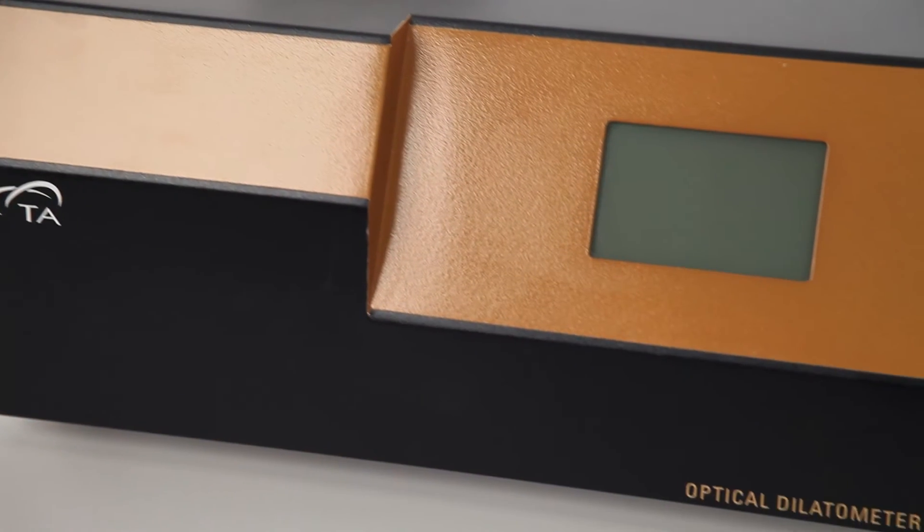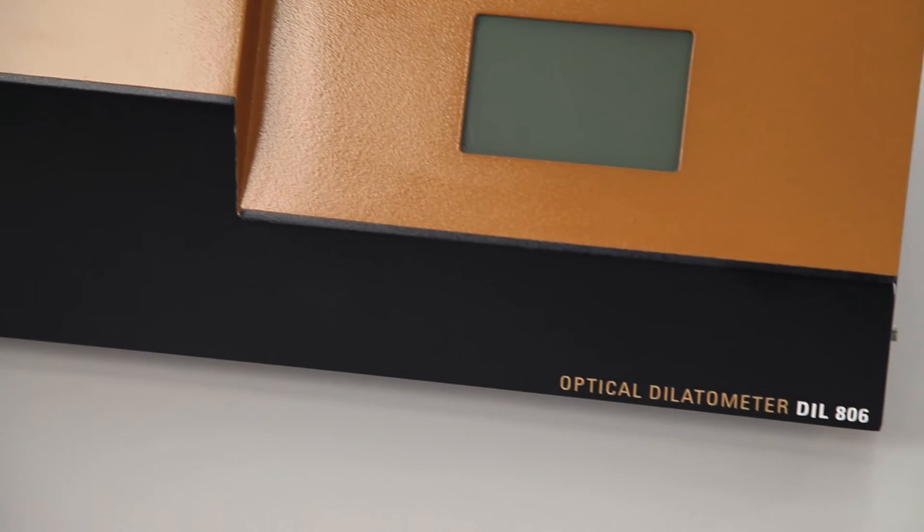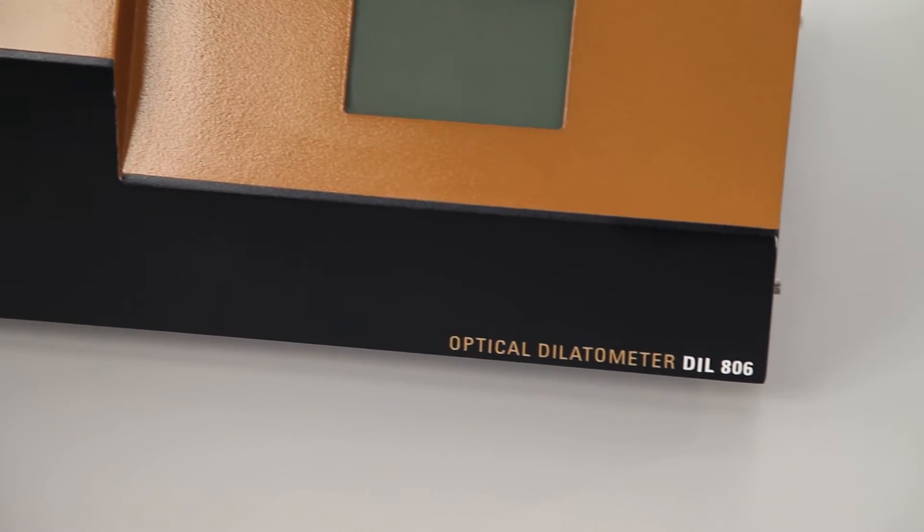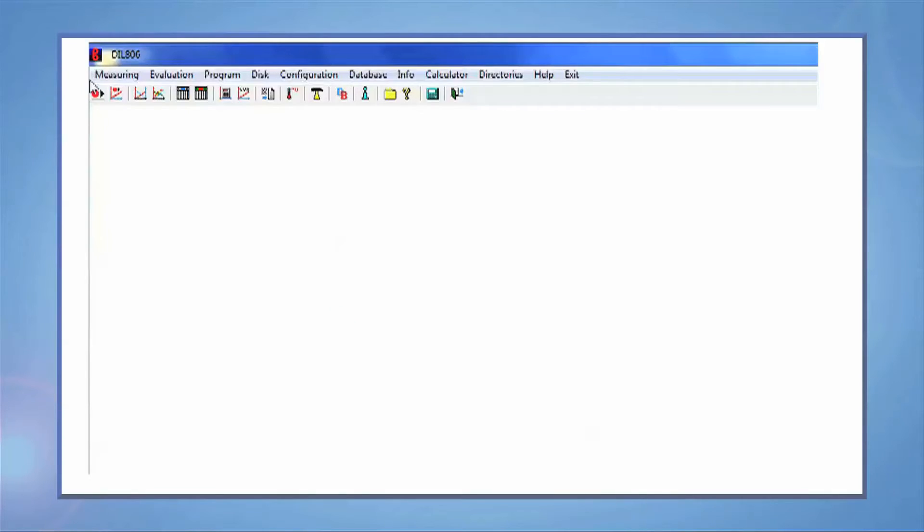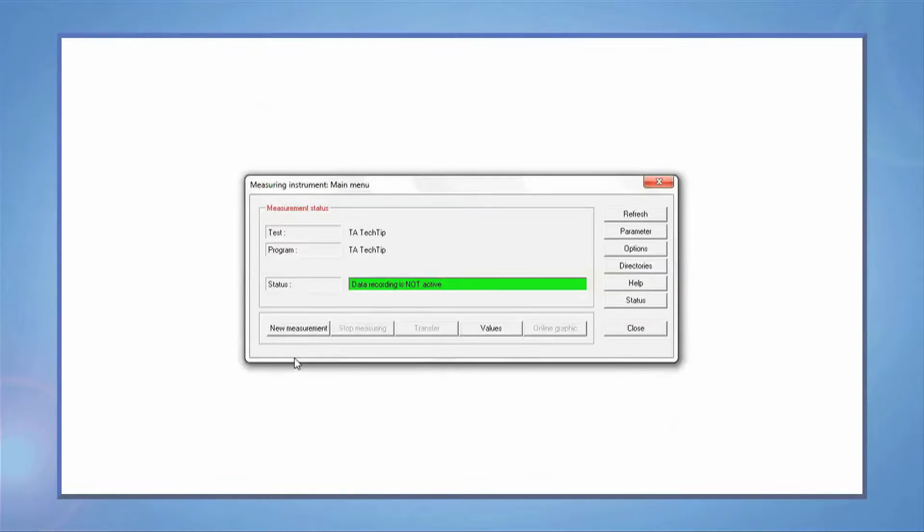All dilatometers have the same software interface. To start your experiment, select Measuring. The status should show as green to start a test.